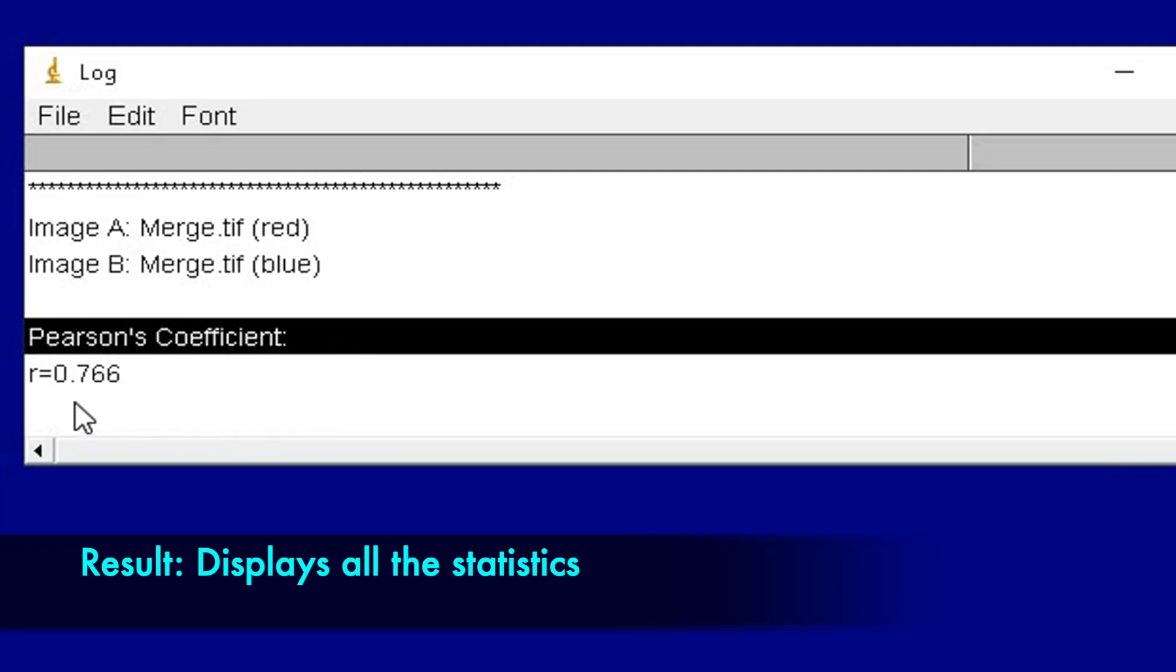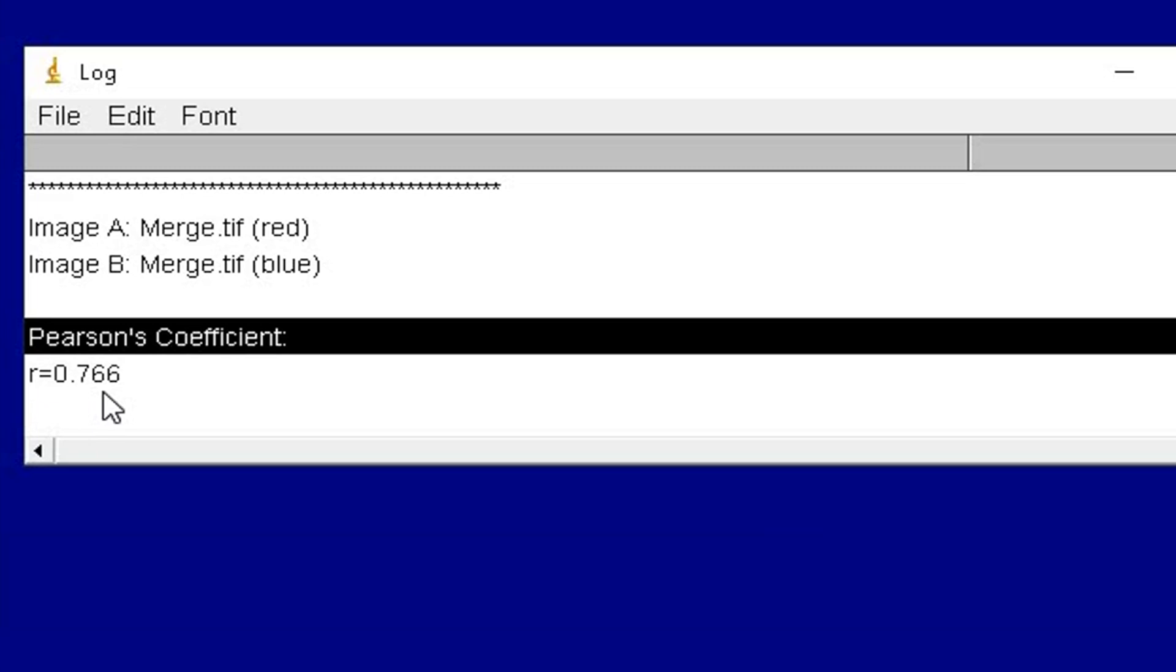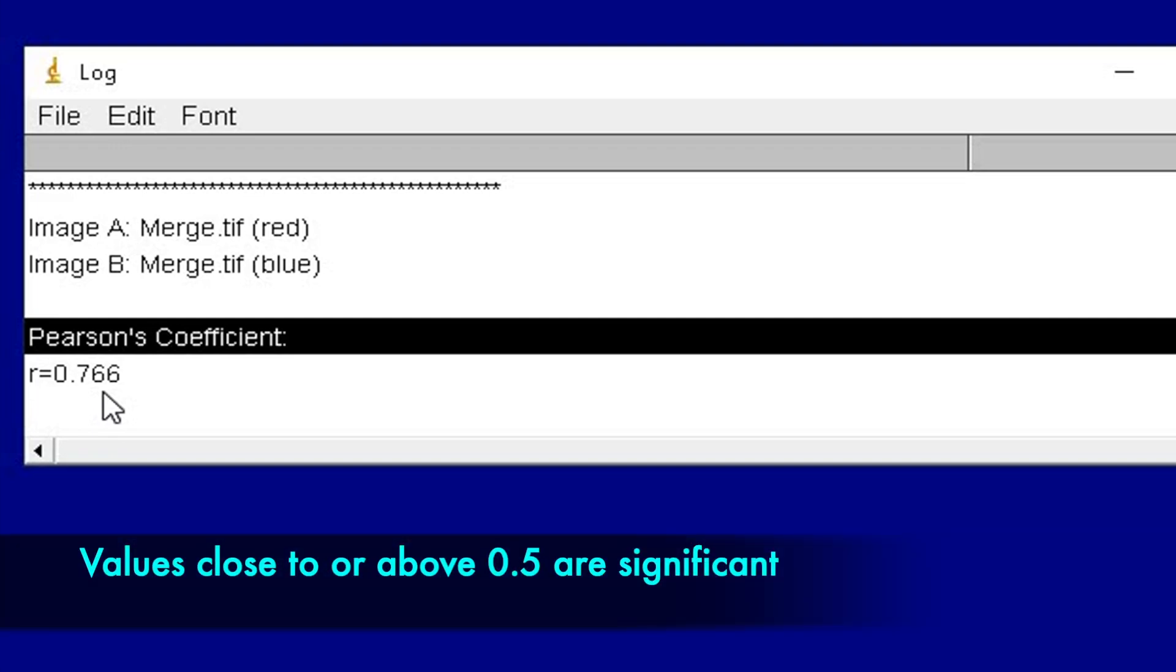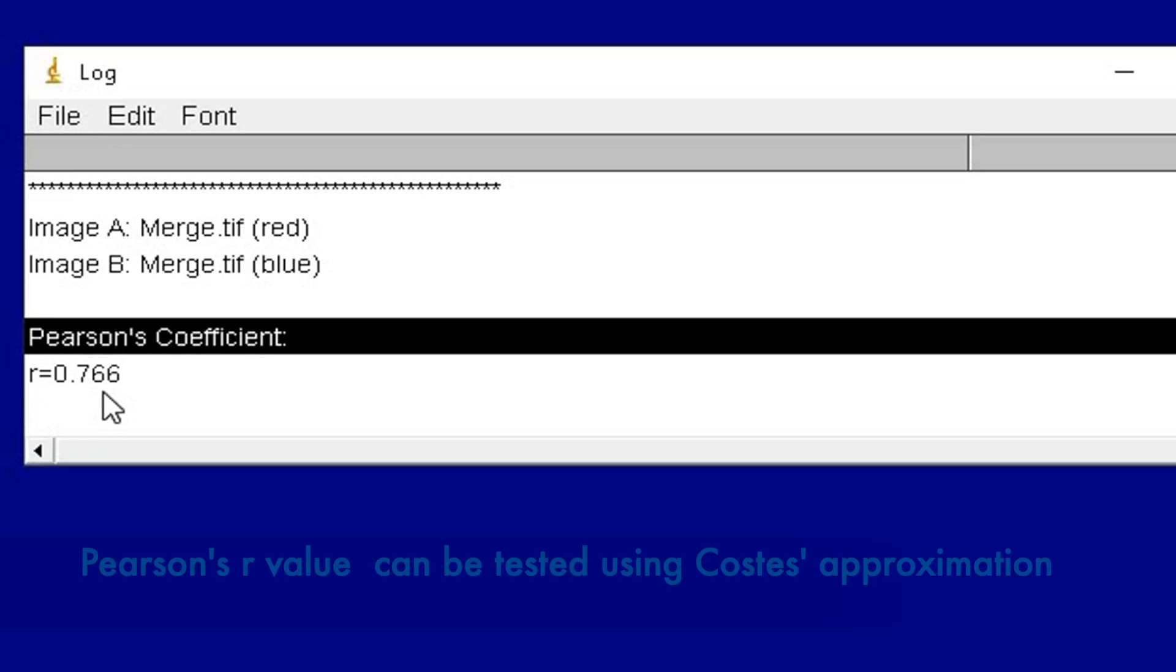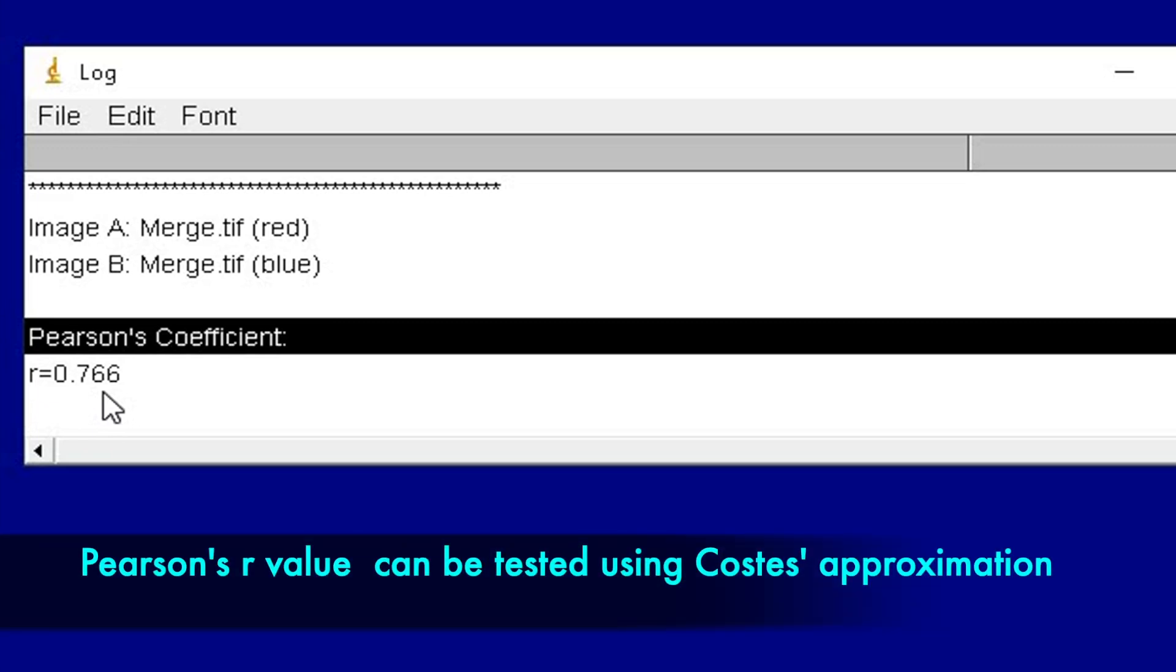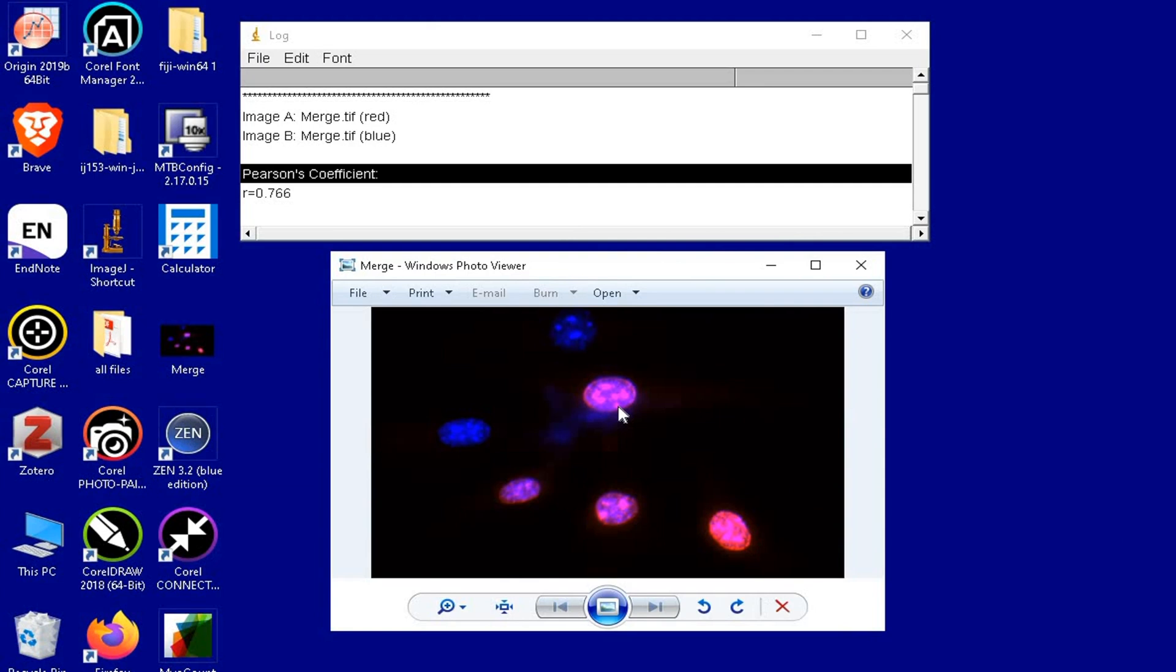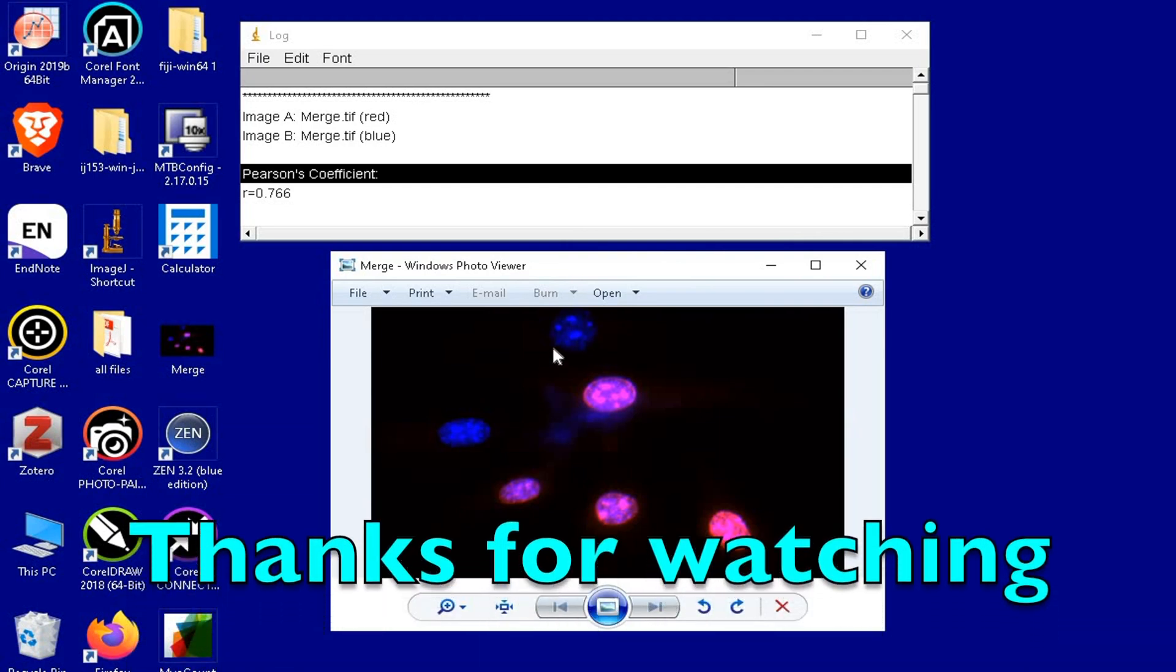In this case, the R value is equal to 0.766. Values close to or above 0.5 are considered statistically significant. The significance of Pearson's R can be further tested using Costes' approximation. Thus, we successfully determined the colocalization using Pearson's coefficient of the two-channel image.